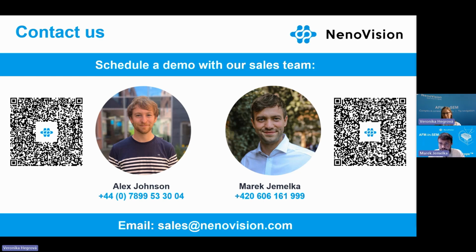Then we can go directly to one of the newer ones from Jaita. What is the resolution of the AFM? What is the maximum scan area?